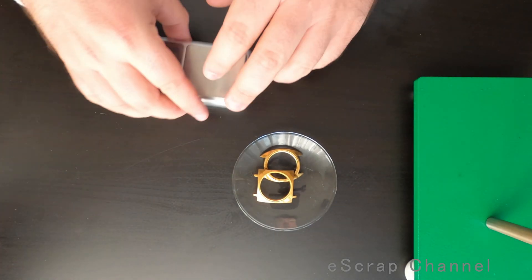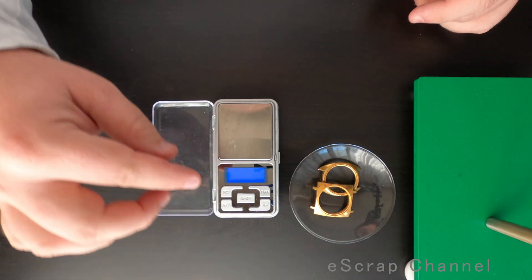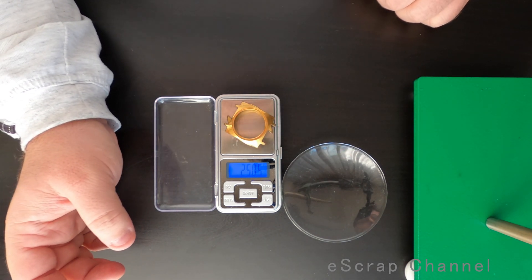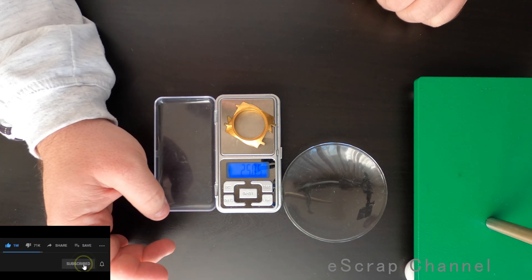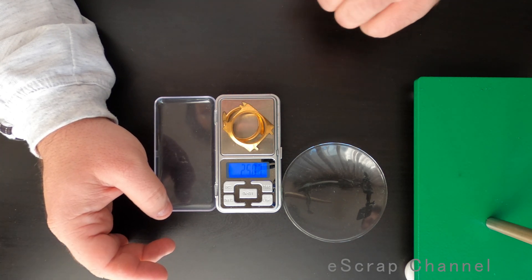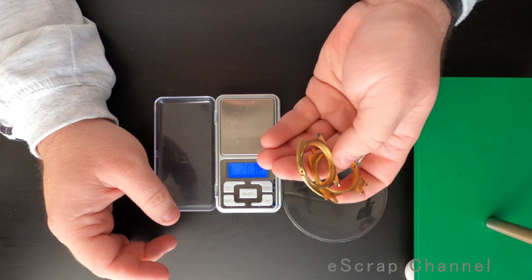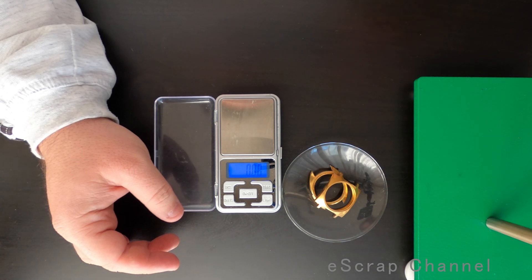What is the first thing to do? I have to calculate how much acid I need to get rid of the base metal. Let me start the scale and check the weight of these two. So it's correct to say 25 grams. If this is 25 grams, this means that I will need about 75 milliliters of nitric acid at 60% to dissolve the base metal. 75 milliliters. Let's go to the lab now.